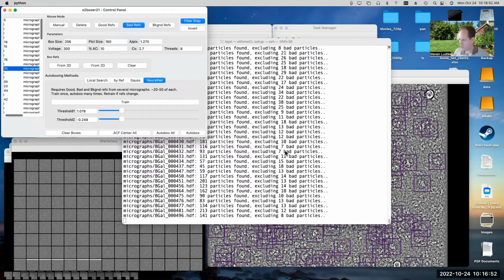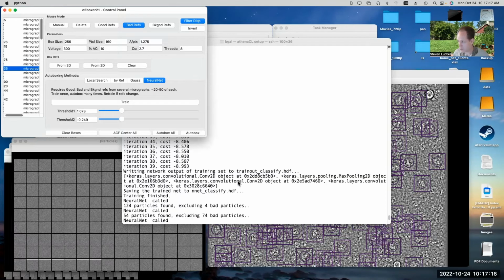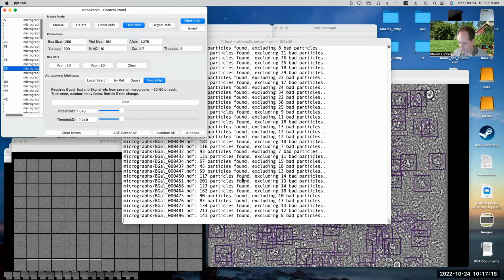I mean, if you are a deep learning programmer and you're trying to understand it from that perspective and trying to improve things, then what you're talking about makes sense, sort of looking at that network fidelity. But for a typical end user who doesn't know anything about a neural network or what a convolutional neural network is, basically just looking at the cost and making sure that it's sort of decreasing and sort of eventually kind of stabilizing a bit is all we really target. Okay.